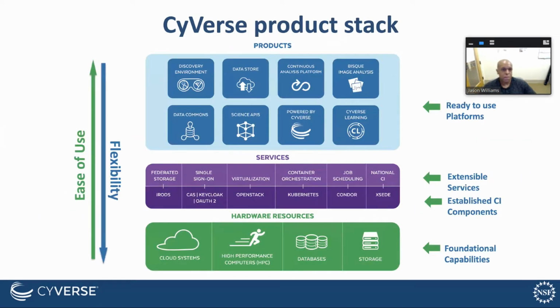Although we will only be covering a small subset of the materials and resources available, there's an entire product stack of everything from the image analysis to various tools for learning, APIs. We're going to be working a lot today in this thing called the discovery environment, and also working with some of the data products. And if you were more of a bench biologist, you'd be working at this sort of layer of these nice, simple and easy to use web interfaces.